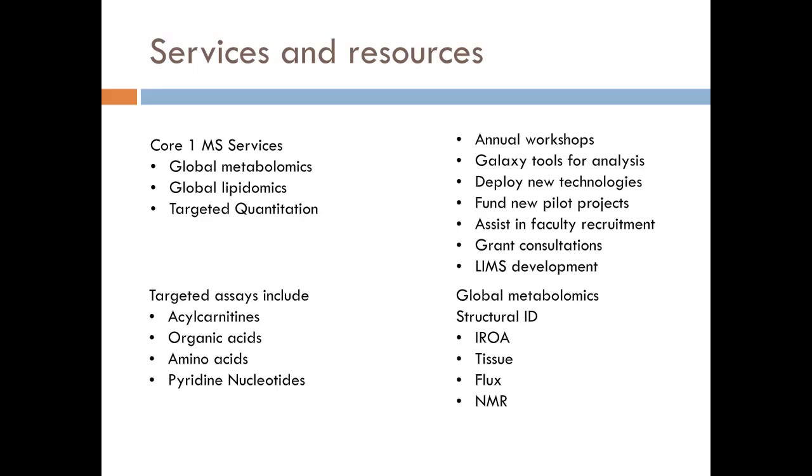As part of our center, we offer tools and workshops. We have an annual workshop to teach people metabolomics. We use our website to deploy new technologies, ways in which you can dig into the data, and some of the things I mentioned earlier about funding projects. And of course, a key part of this is encouraging new faculty to use metabolomics and trying to teach them the best opportunities that are there.